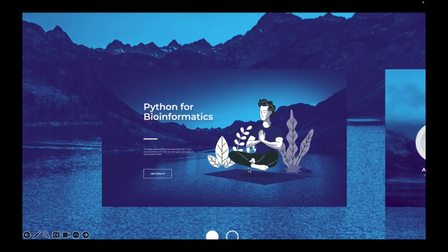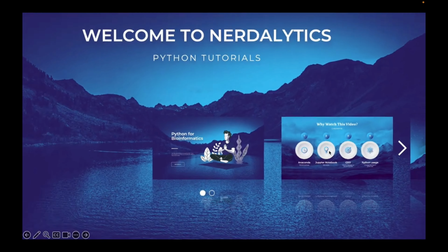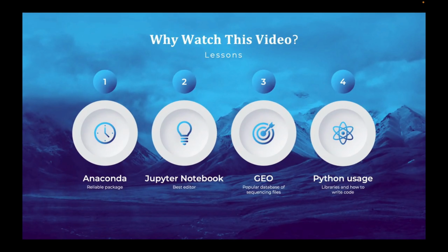Today in this tutorial we are going to learn about Python skills, but this Python programming tutorial will be only for the bioinformaticians out there or those who are doing genomics research. So we are going to do a mini project as well, and also we are going to learn how we can set up the Anaconda package manager, how we can initiate a conda environment, and also how to launch Jupyter Notebook to write Python code.